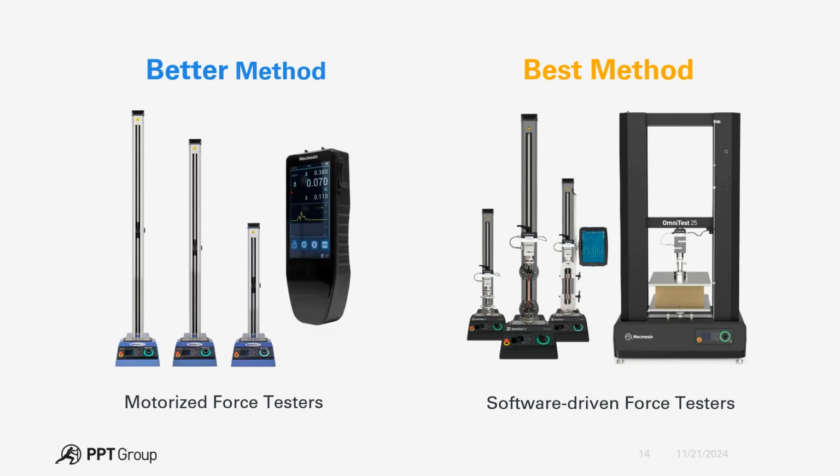And then when it comes to reporting, you have different options for exporting your data to Excel or to a CSV file, or to generating PDF test reports. And then obviously you can also make different modifications to the test depending on what your needs are through additional calculations and so on.